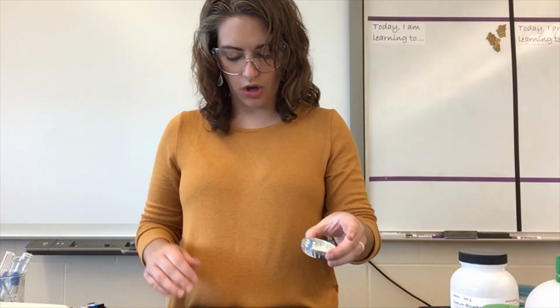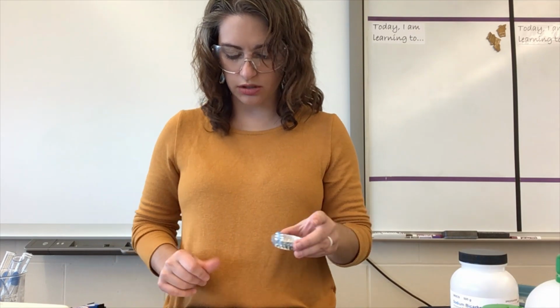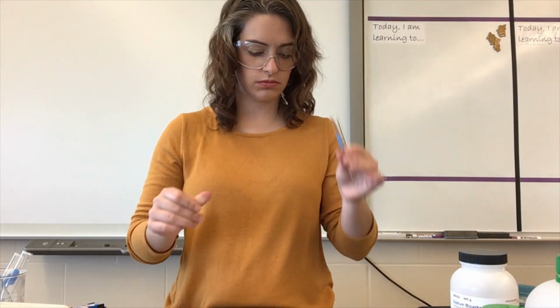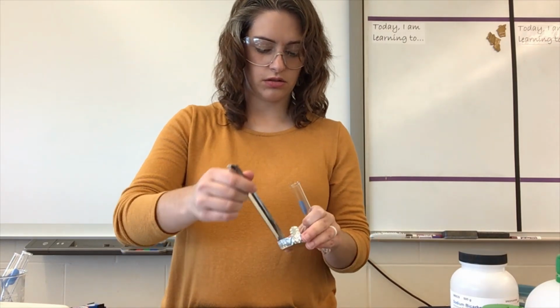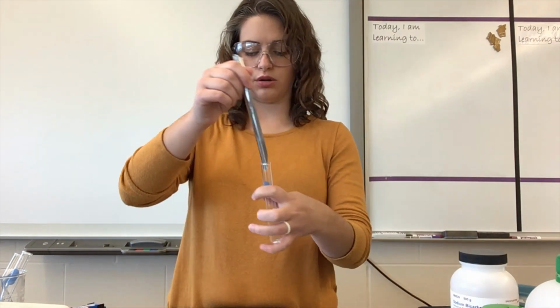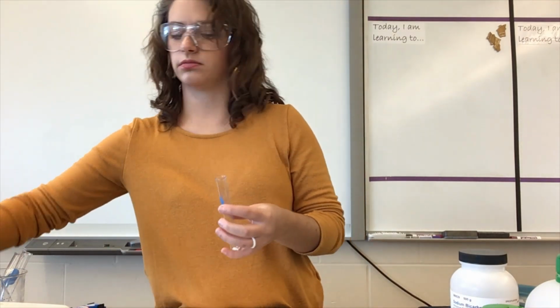Okay. So my sucrose, let's test its solubility. So clean test tube. This one, just based on your experience with sugar, you probably already know the answer to.